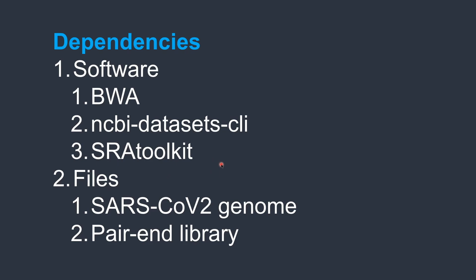We will download the coronavirus genome as well as a paired-end sequencing library that contains reads from the coronavirus genome, because the sample is taken from a coronavirus-infected individual. Let's start downloading the dependent software and the dataset to perform BWA alignment.